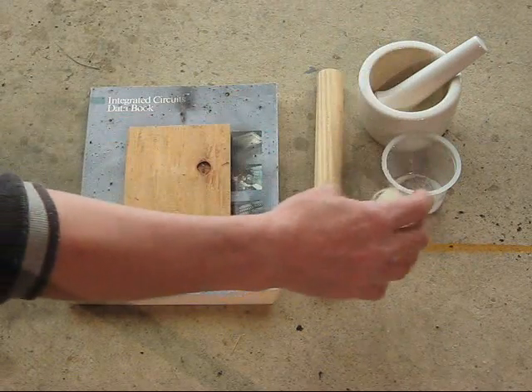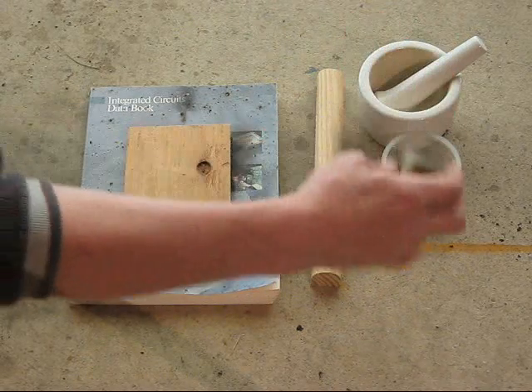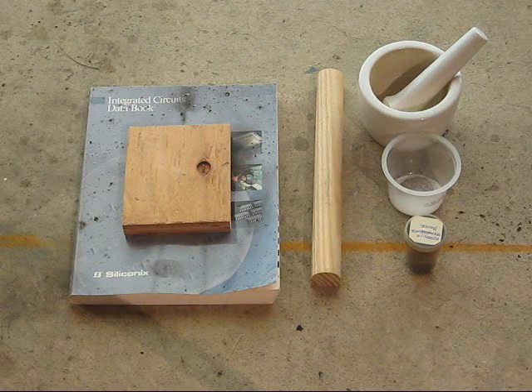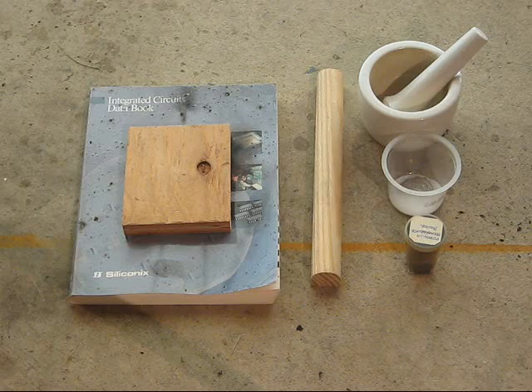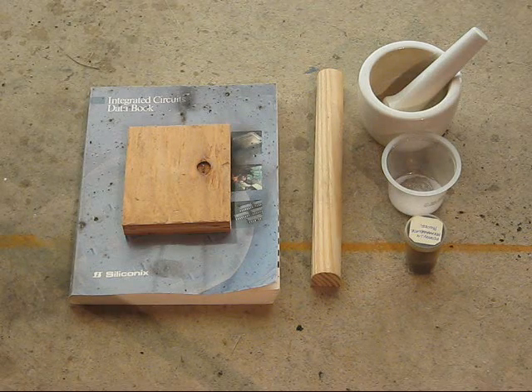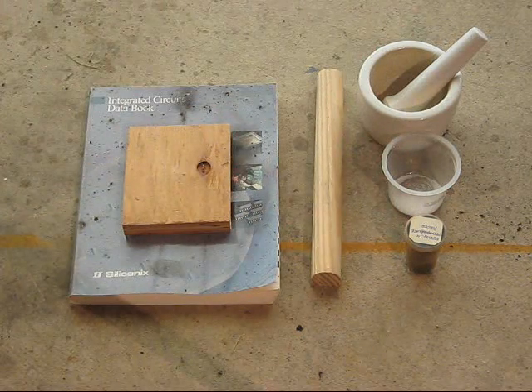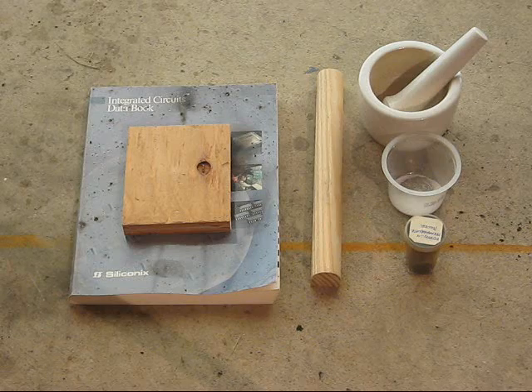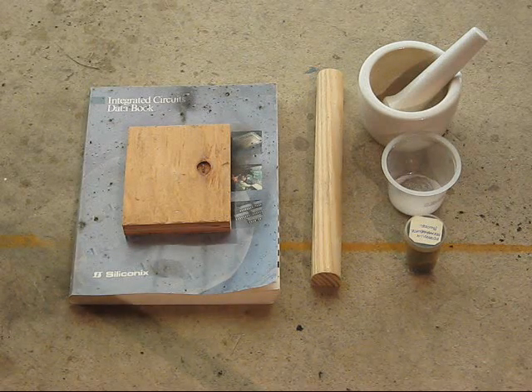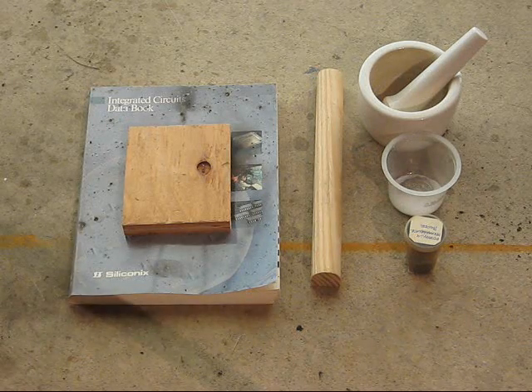I bought it as crystals and ground some into a powder using a mortar and pestle. This is going to be mostly a demonstration of why you don't combine stuff like this and then begin grinding it together — it will not work out well for you.